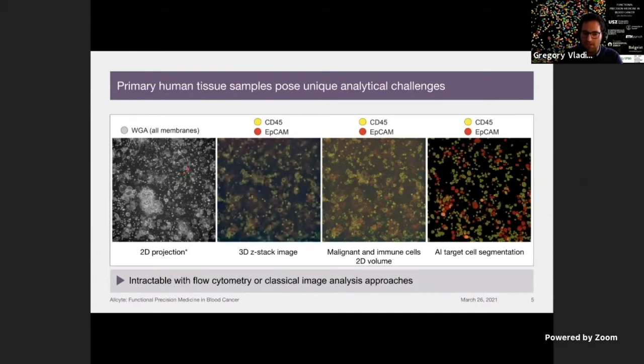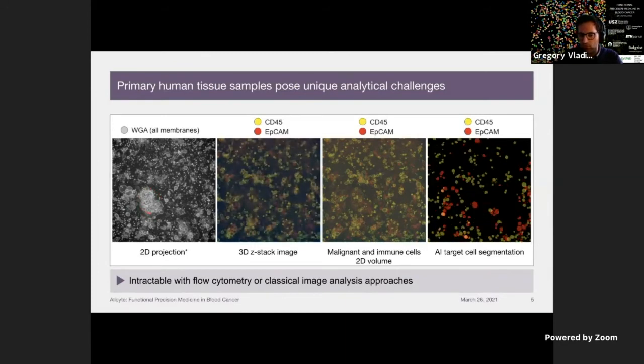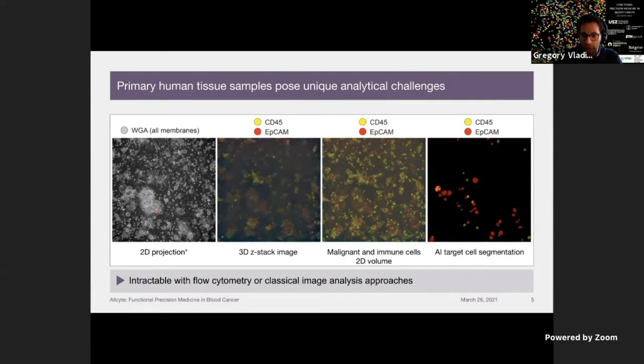And so we're keeping intact, we do get single cells. What we end up with is a mix of single cells and what we call microaggregates. These are 50 to 100 cell pieces or aggregates. I believe the cell contacts are representative of what was available, what was there in the solid tumor.